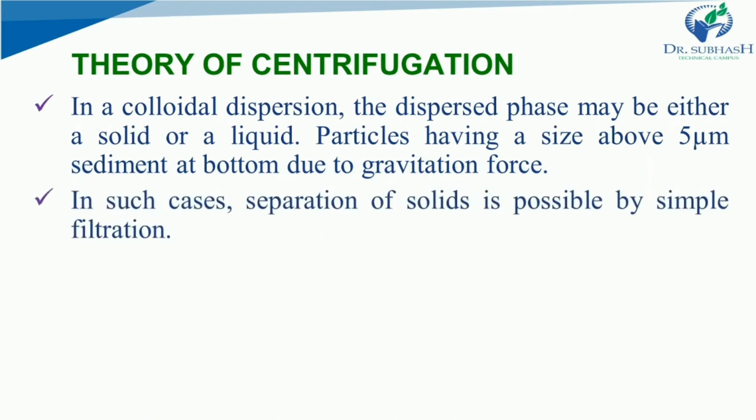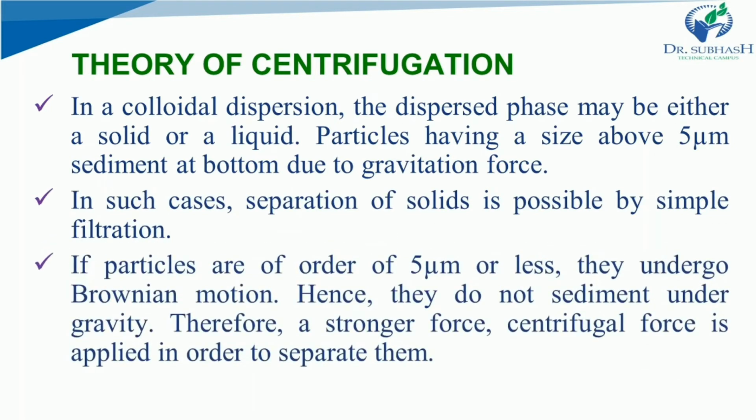In such cases, separation of solid is possible by simple filtration. You can easily separate solid by filtration. If particles are of the order of 5 micrometer or less, they undergo Brownian motion, and hence they will not sediment under gravitational force. Therefore, a strong force, that is centrifugal force, is applied in order to separate them. About Brownian motion, you will learn in your coming semesters in the subject physical pharmacy. You will learn it really well, so focus on that topic.